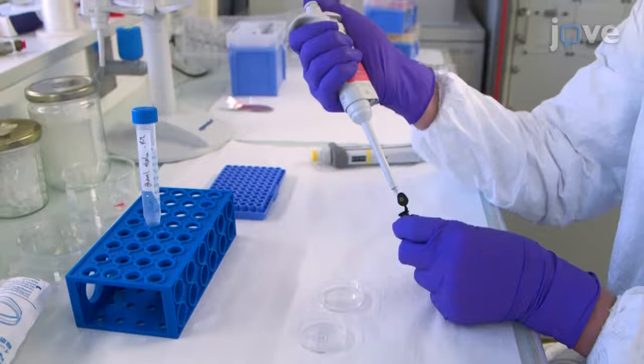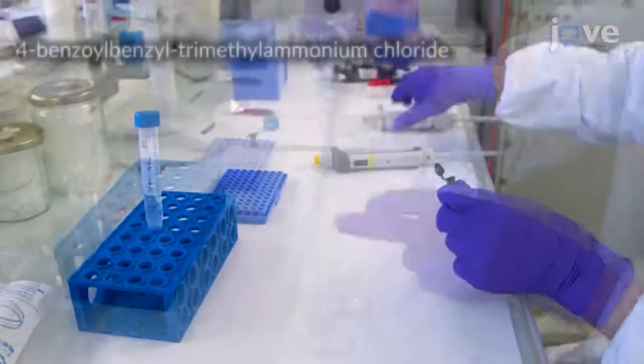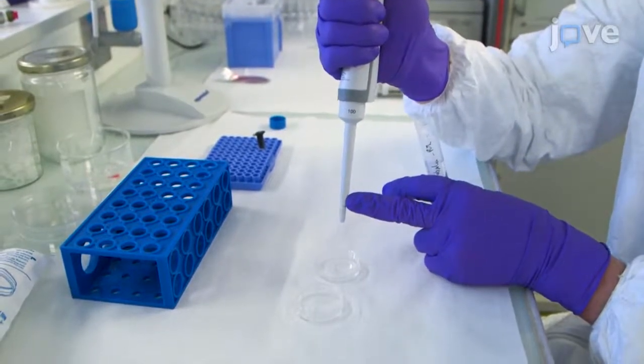For gel deposition, at the end of the incubation, add 3 µl of PLPP and 50 µl of absolute ethanol onto the center of the slide and wait until it dries completely.